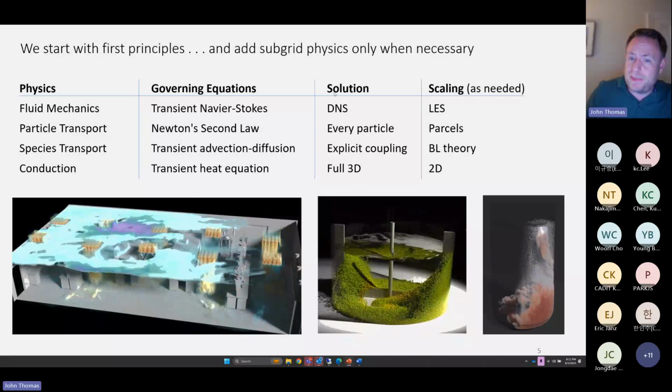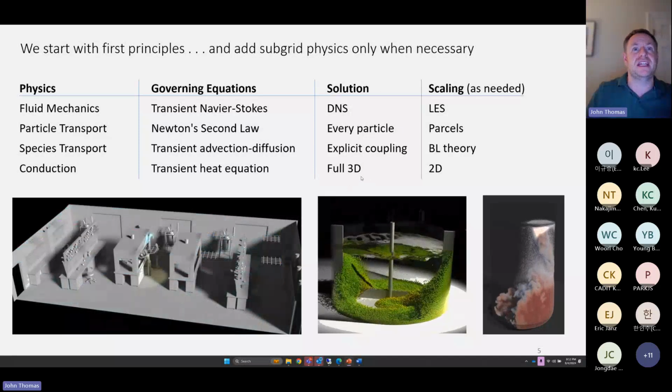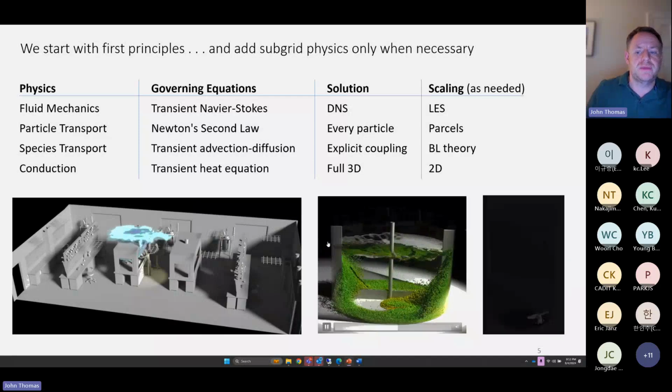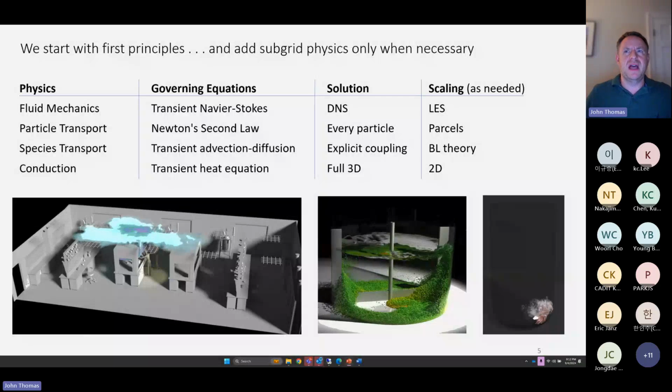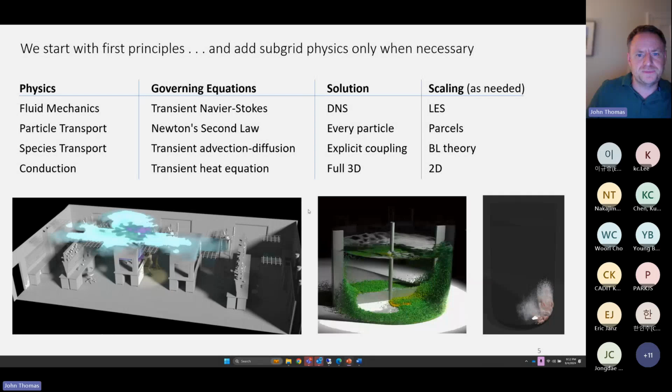So again, this will not be practical when running on CPUs, right? But this becomes immediately attractive when running on GPUs that make these simulations industrially relevant. And everything I'm showing here is maybe a couple hours of runtime on a laptop. And that's what I'm talking about, the speed improvement that comes from GPUs.